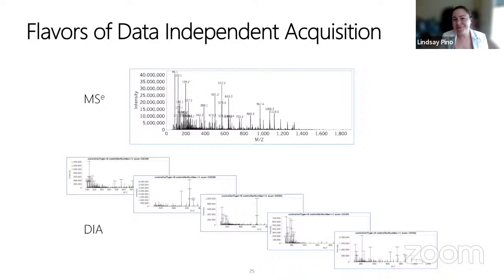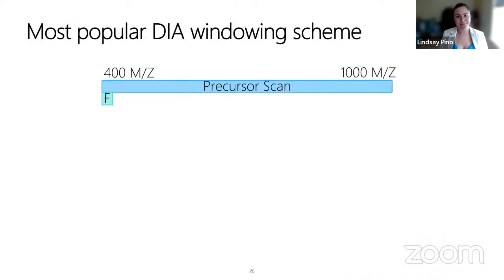So MSE would be super great. The computational proteomics isn't quite there yet for MSE, but maybe in the future. For now, DIA is definitely the flavor du jour for doing these DIA experiments.